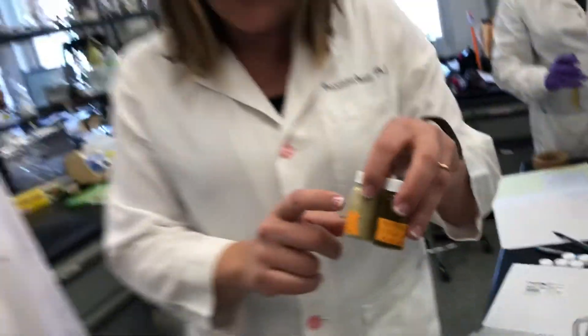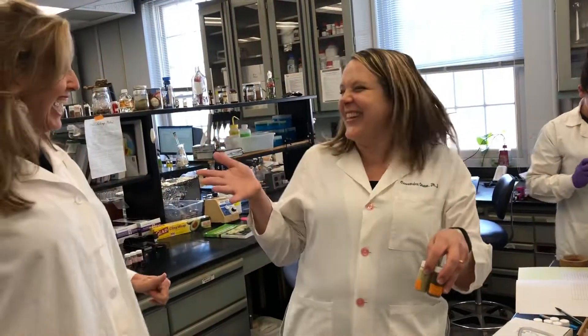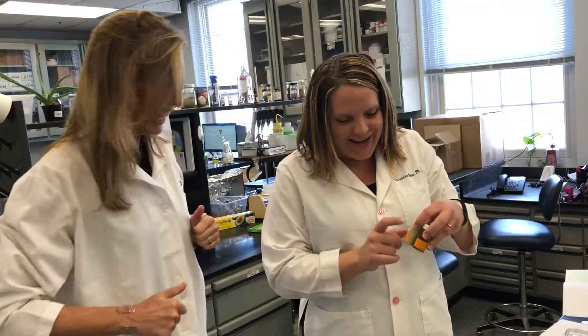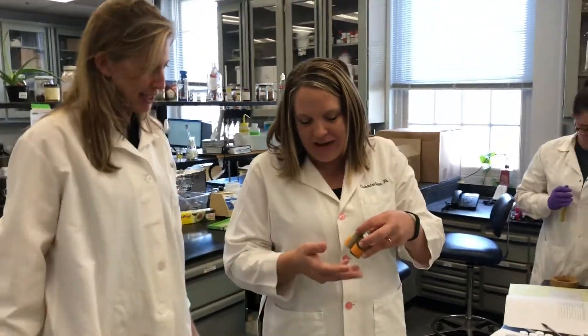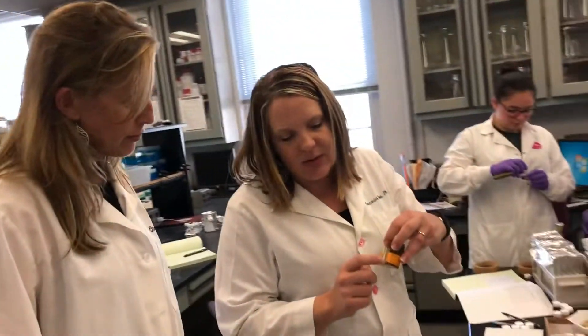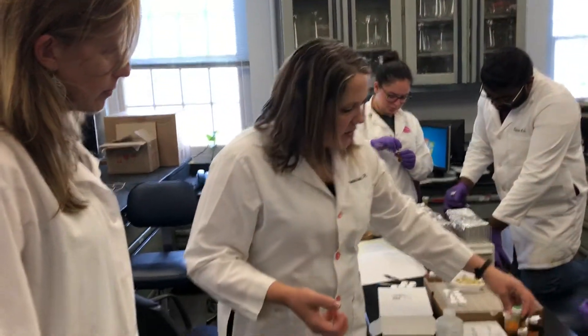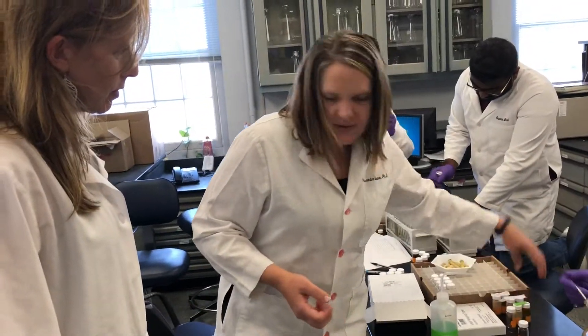This is our drug. Can you guess how many compounds are in there? A lot — you're right. It's a mixture; an extract is a mixture of compounds found in the plant. And this liquid is basically a rinse that we use to get the remaining stuff that's stuck to the side.